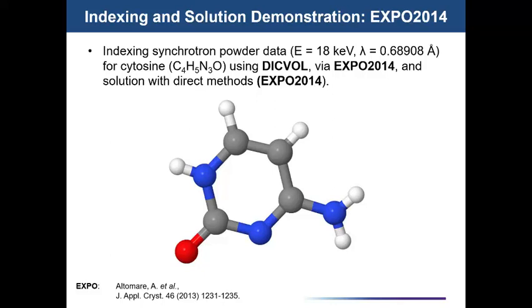So I'm going to suggest that there should be 4 formula units here. We're going to say OK. And I have to press a button here. What it's going to do is run a Lebail refinement to try and extract the intensities. You'll notice there's some extra peak positions down here because we haven't defined a space group, but they're not real, and it's finding very, very little down there. I'm going to say next again.